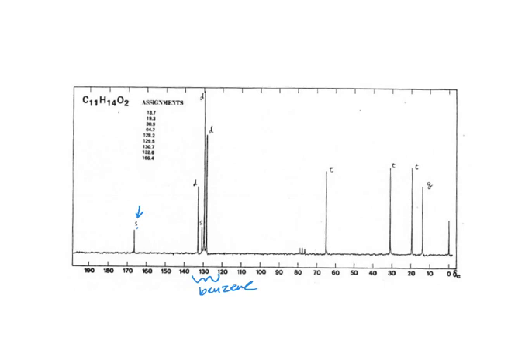How did you find that there was a benzene ring over there? Okay, well, I think just in this region, so the benzenes are going to probably be somewhere between around 100 or 110 or something, down to maybe 160. So this is kind of the benzene region. Though other alkenes could be in that region as well.